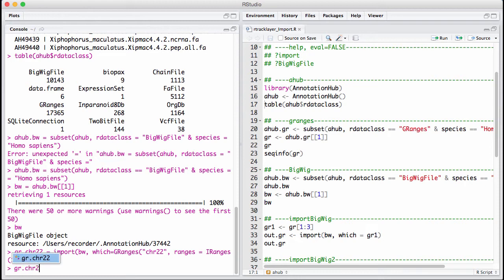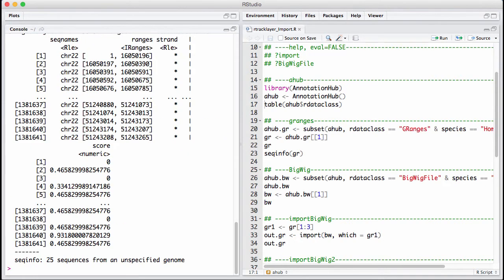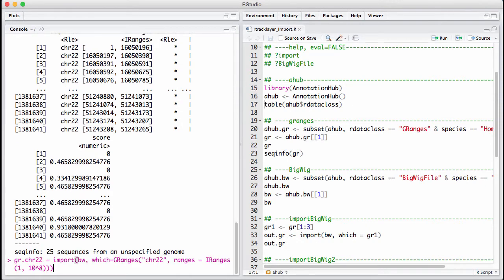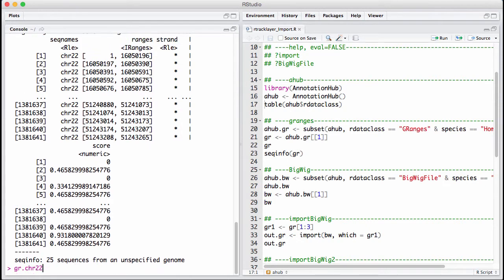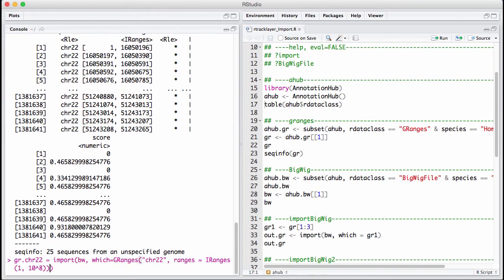We see here, we read it in as a GRanges with a lot of ranges. There's about 1.3 million ranges in this object. We have discussed run-length encoding, and this seems like it might be relevant to have as a run-length encoded vector. So we can use the as argument to the import function and say instead of a GRanges, we want it back as a run-length encoded vector.